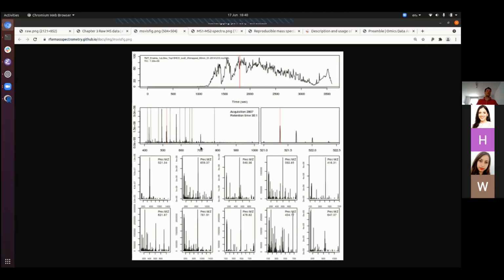And 20 seems to be a reasonable compromise. We could want to use more, because this information here in MS2 is the information that can be used for identification of data, to know exactly what peptide sequence this is. And so on one hand, you might want to say, well, I want to acquire as many MS2 scans as possible for each MS1 scan.